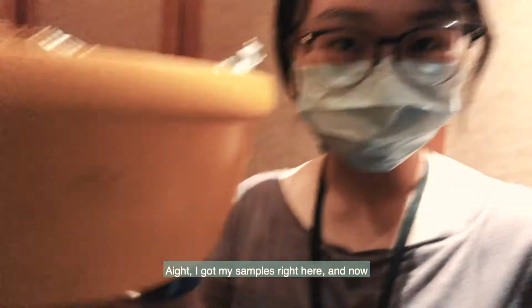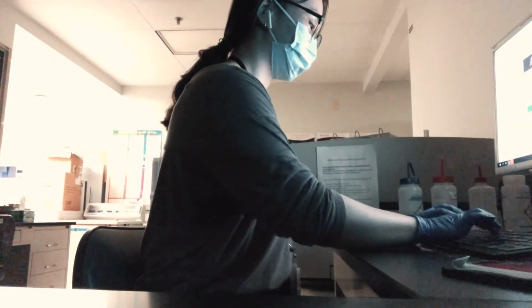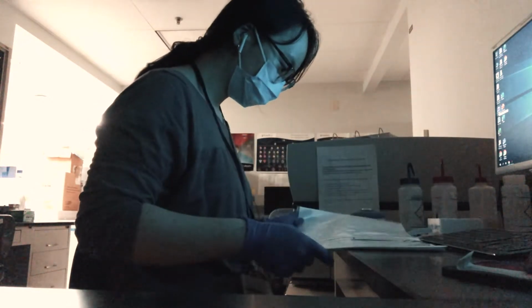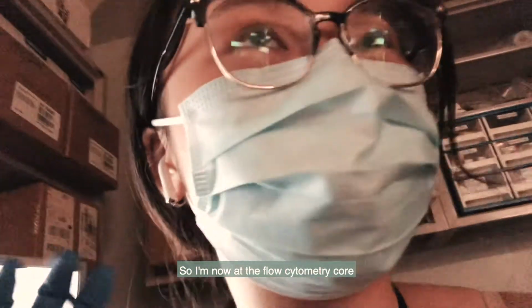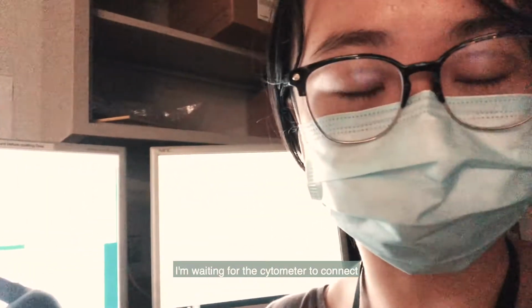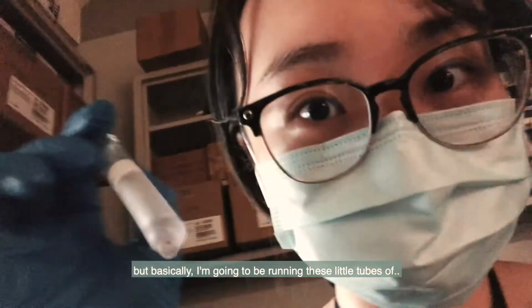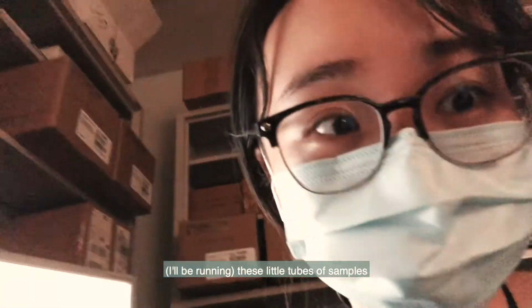All right, I got my samples right here, and now I'm on the way to the flow cytometry core. So I'm now at the flow cytometry core. I'm waiting for the cytometer to connect. But basically, I am going to be running these little tubes of, it's dripping water. These little tubes of samples.